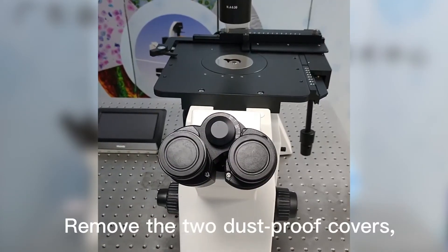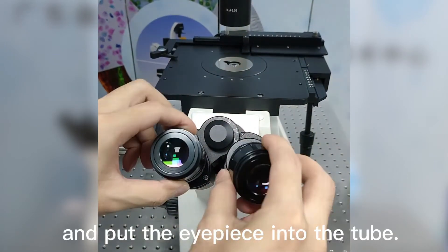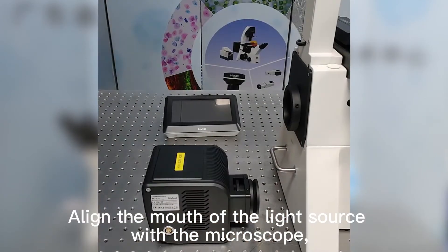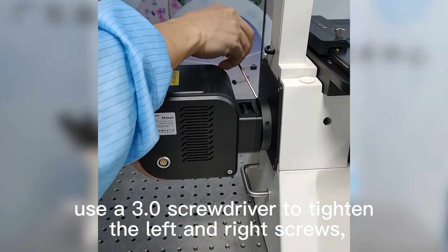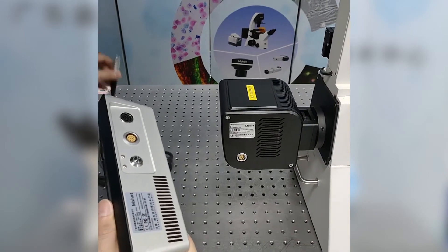Remove the two dust-proof covers and put the eyepiece into the tube. Plug in the connecting line and power line. Align the mouth of the light source with the microscope. Use a 3.0 screwdriver to tighten the left and right screws, then connect the multiband controller to the light source.